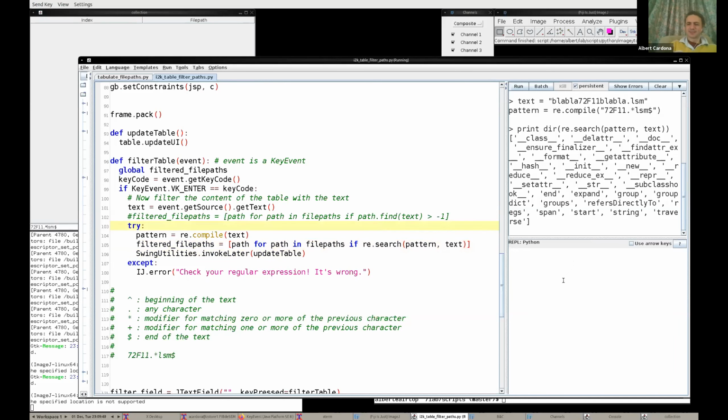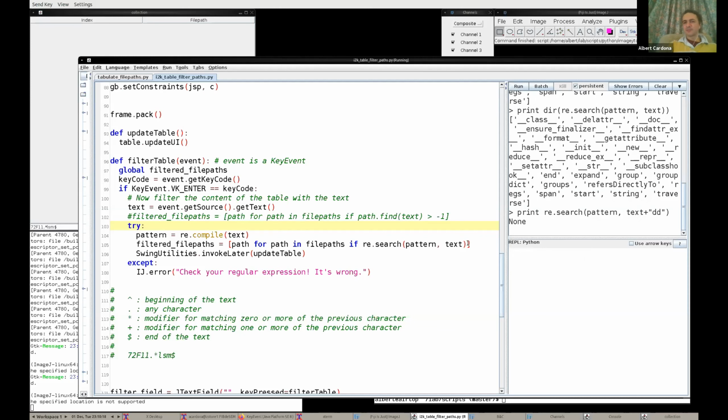Goodness, come on, this cannot be so hard. This would be, it's not expand... I mean, probably, if we look at the groups, the point is this returns not null. Like if the text was wrong, if we add another character here, this returns none. So that should suffice for Python, in which if this returns something that is not none, I think it should work.